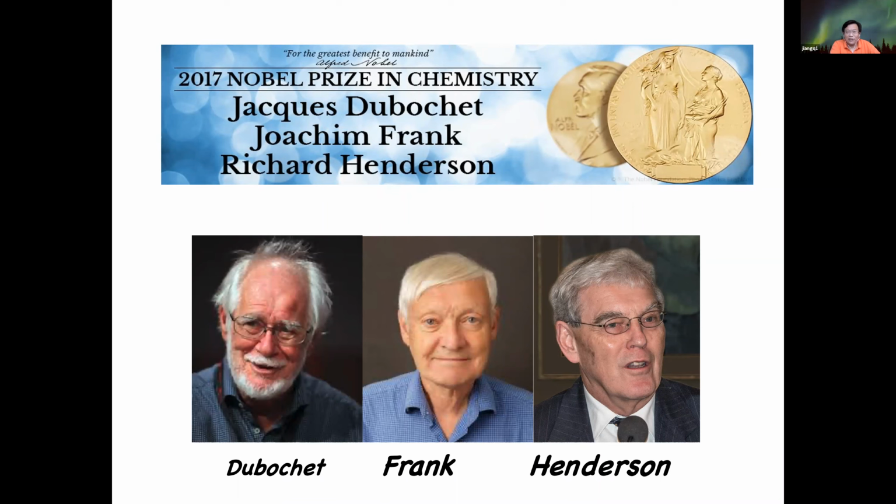Because of this major advancement, three pioneers in the field were awarded the Nobel Prize in 2017. So here are the images of the three pioneers, Jacques Dubochet, Joachim Frank, and Richard Henderson. Dubochet developed the first method for flash freezing of the cryo-EM specimens, which is very important for preserving atomic resolution information of biological specimens.